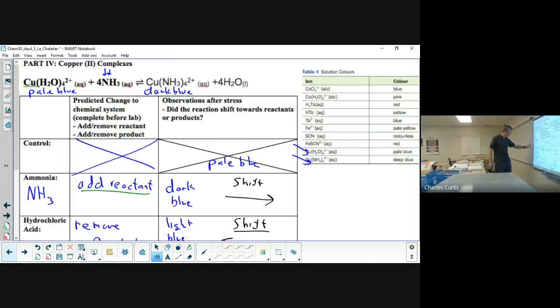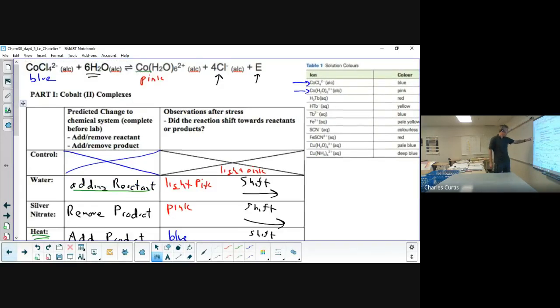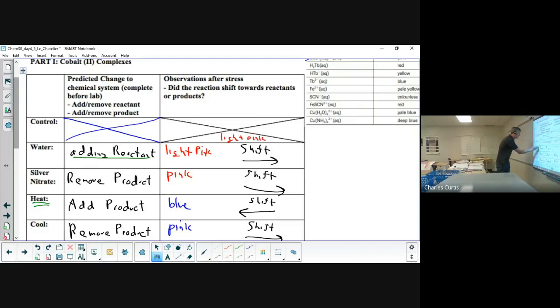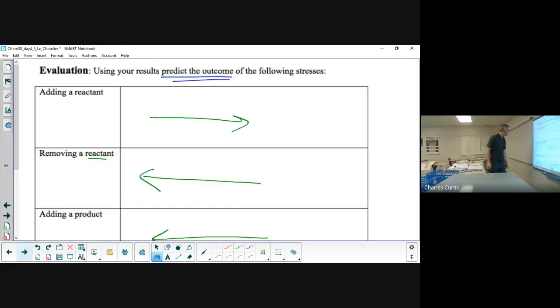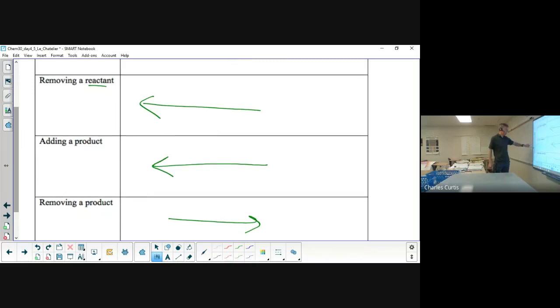So remove product. No data points there. Yeah, we have remove a product, and it did in fact shift to replace it. So everything is kind of seeming to lead towards some sort of opposite pattern. Whatever you do or somebody does to an equilibrium system, it seems to want to shift to do the opposite. And that is the whole point of this lab, for you to see that experimentally. Le Chatelier's principle, the heart of it, paraphrasing, is whatever you do to a system, the equilibrium will shift to try to undo or counter what you did. Okay. And that concludes this lab.